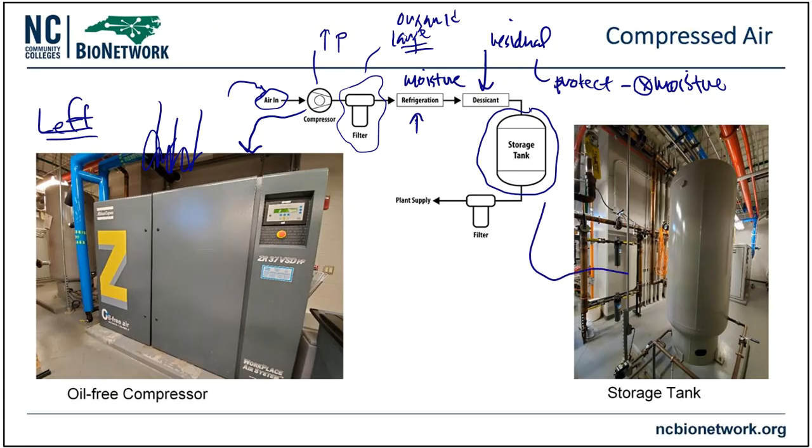And you can see one of those images of a storage tank here on the right-hand side in that picture. Often very large because we need a lot of it. We don't want to run out, and it's got to be ready. These are not gas tanks that you would see maybe in our laboratory spaces. That is about as tall as I am and very, very slim. These are going to be much taller and much wider, larger vessels to contain these gases that we will need to use for various purposes.